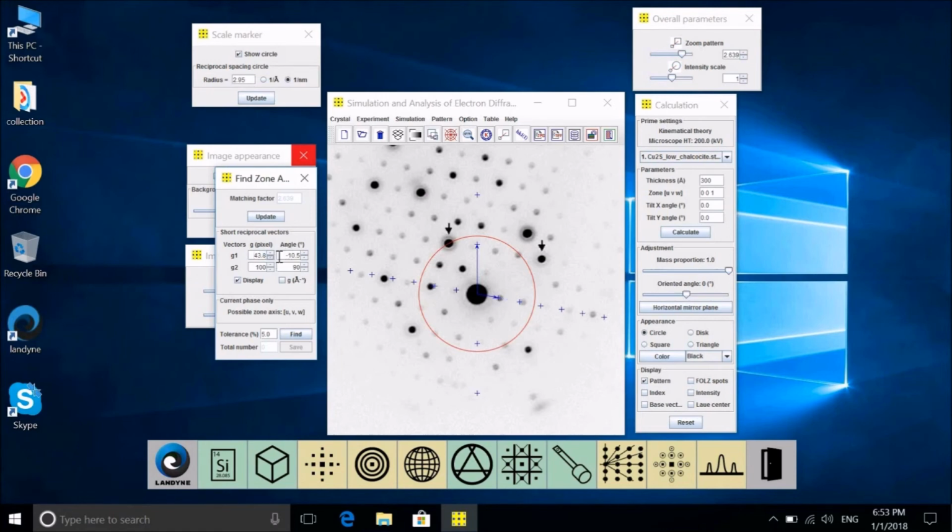Click here again and make it smaller. Not necessarily fixed, but you have all these markers on this line, so fit to that line approximately. Try your best to fit. This will be my best fit. All the markers are filled in this line. So we find that the second line will be this one.